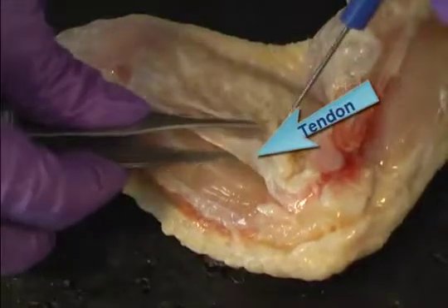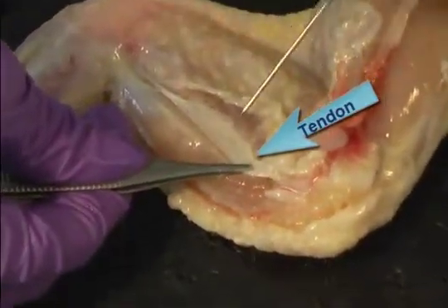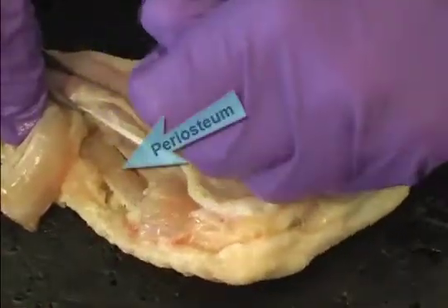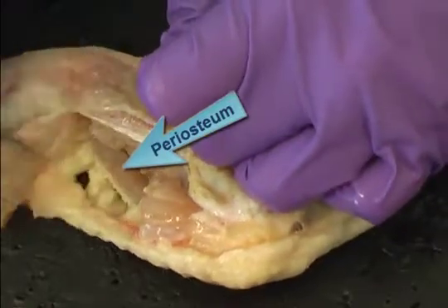Using a dissection probe, find the tendons of the wing. Tendons connect muscles to bones. They are shiny, white, cord-like structures at the end of the muscles. Now remove the muscles and tendons from the bones and examine the outer cover, the periosteum, of the bones.